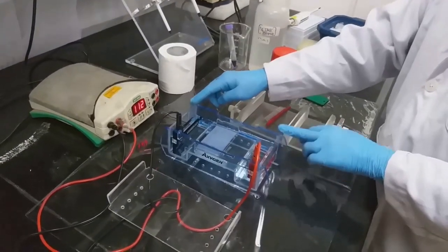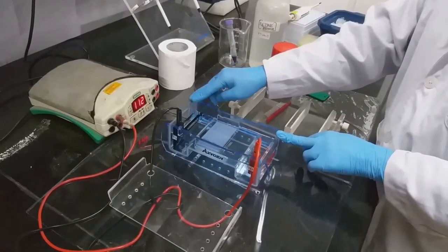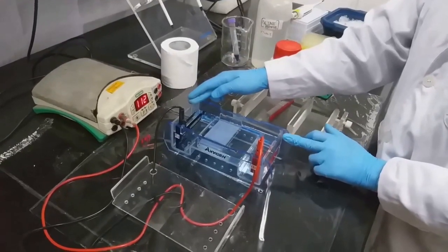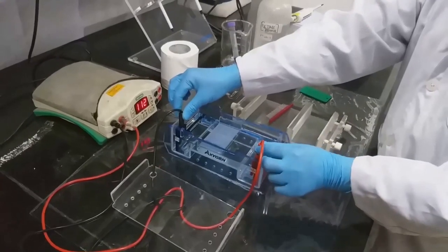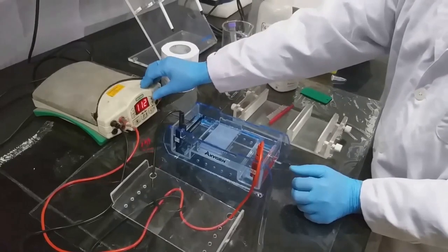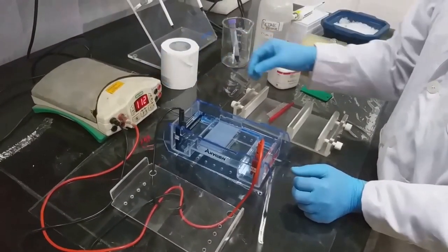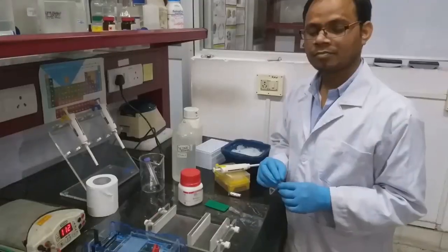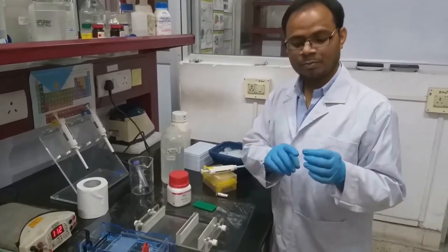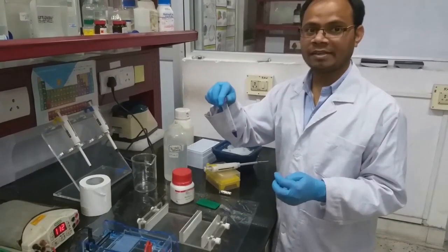Generally, for analyzing the DNA samples, we will use agarose gel electrophoresis. This is the power pack and this is the electrophoretic apparatus. This is a negative electrode and this is a positive electrode. We can change the voltage from here. For loading the samples, we have to mix the PCR reaction mixture with 5x loading dye.